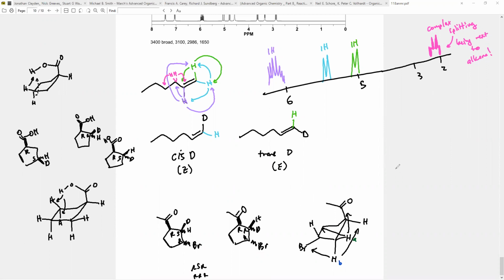Again, one way we see it is we see two peaks, and one nice thing is that they tend to mirror each other. They're like 1H, 1H. And these can represent a CH2 on a molecule. For example, maybe this 1H, 1H is this guy down here. Sorry, let me try these back in. I just want to take out the arrows.